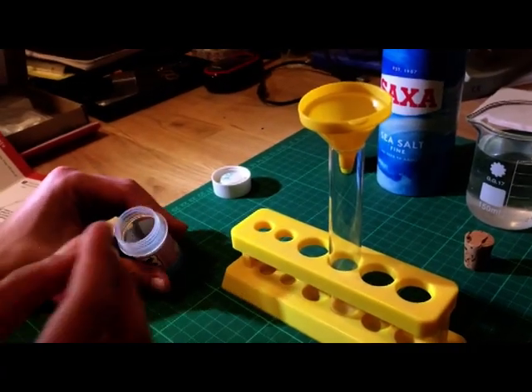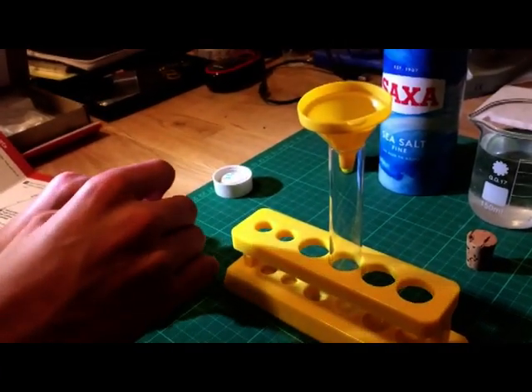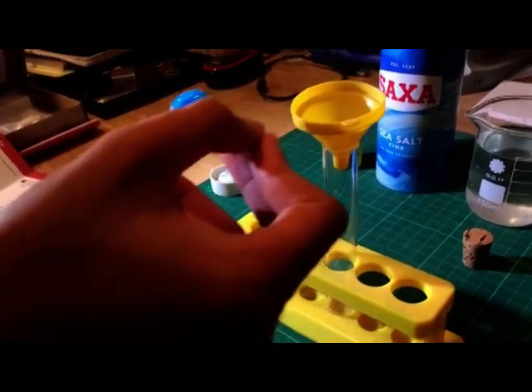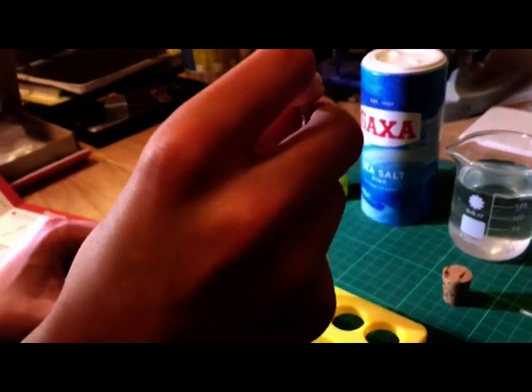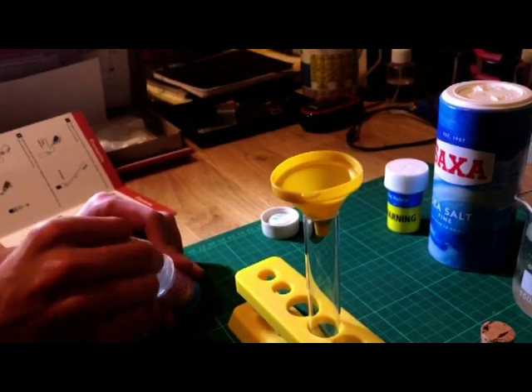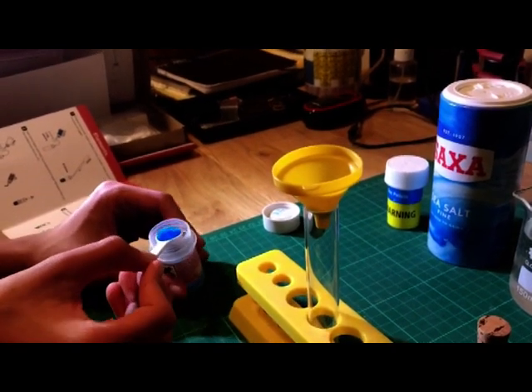To do this experiment you must do the following steps. Firstly, you must prepare some wet copper sulfate crystals in the vial by putting two spoons of copper sulfate inside the test tube.